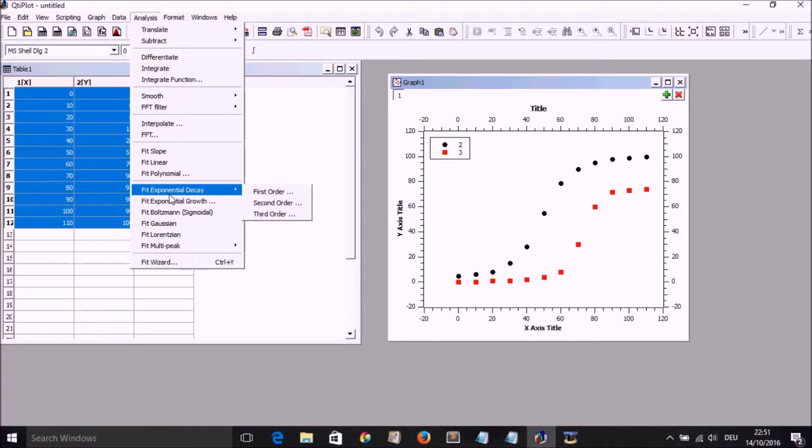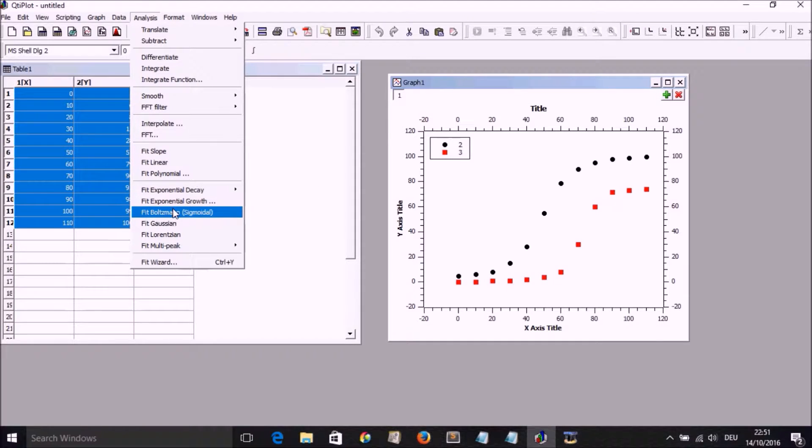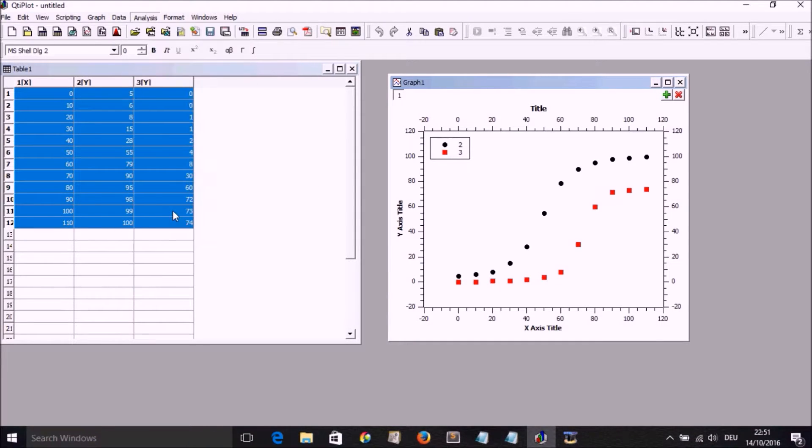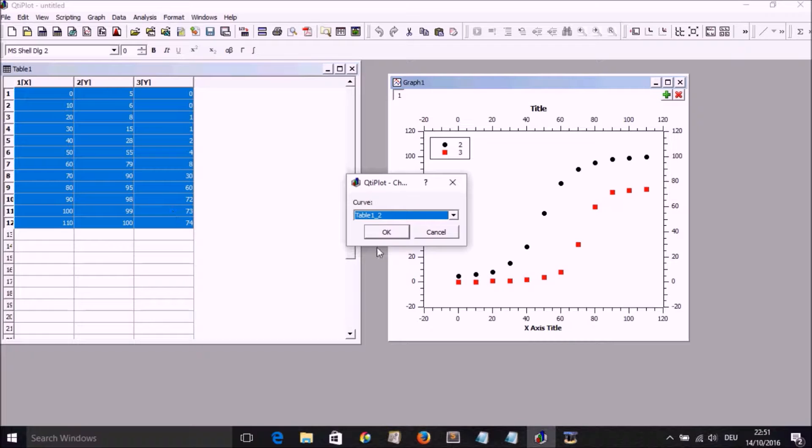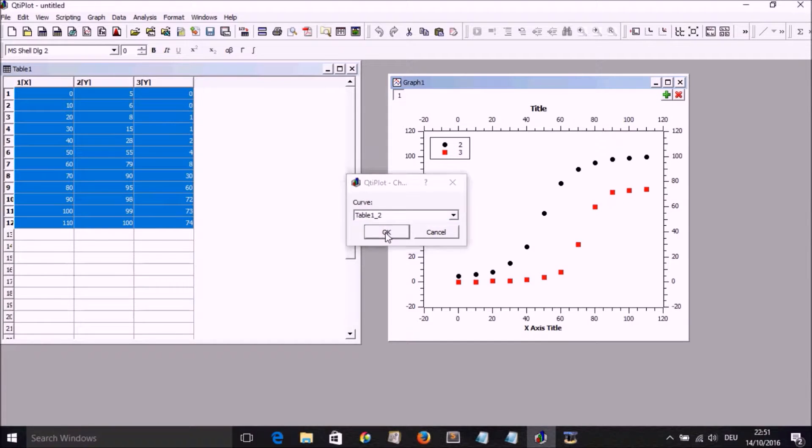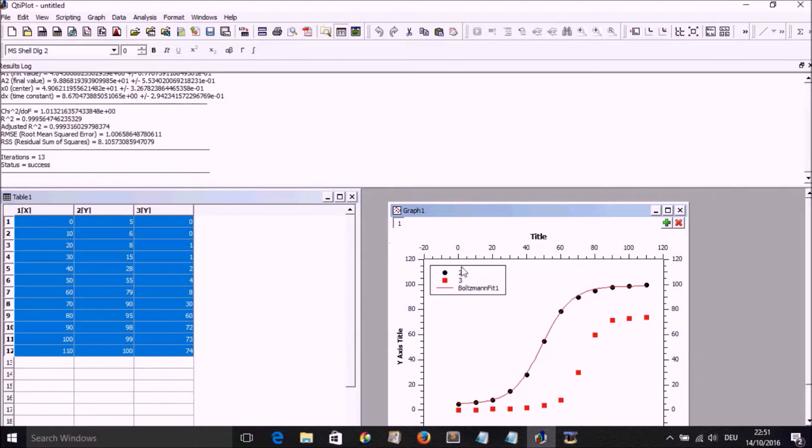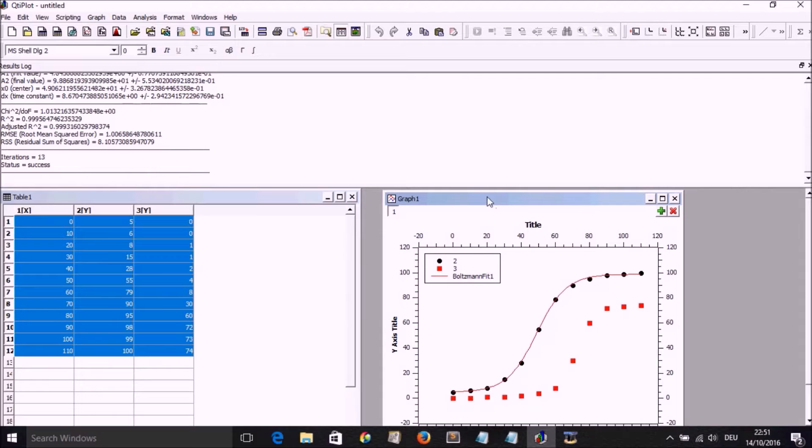To fit, we go to analyze, fit Boltzmann, and we select the curve we want to fit, and we're going to have our fit coming up there.